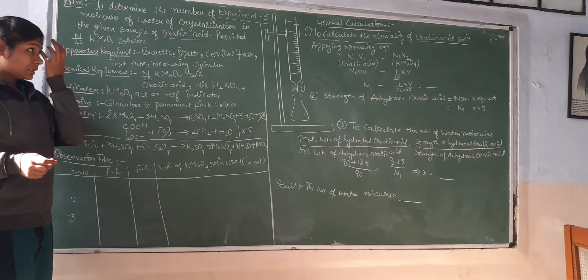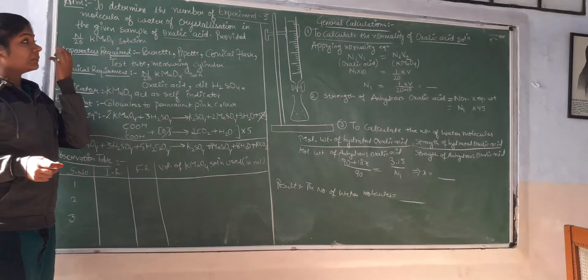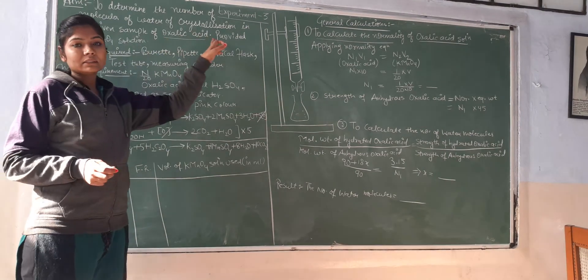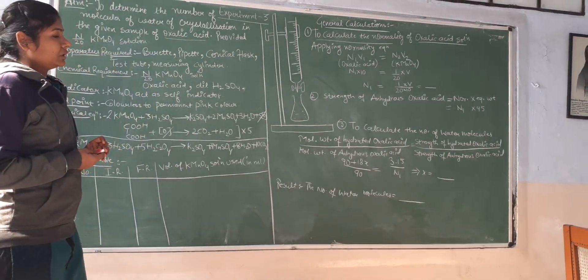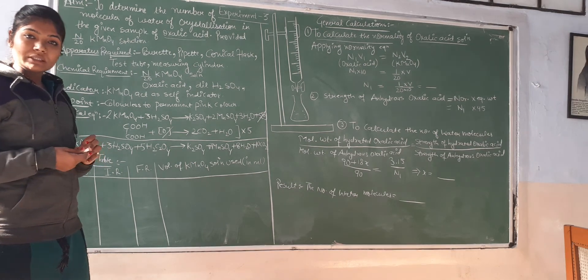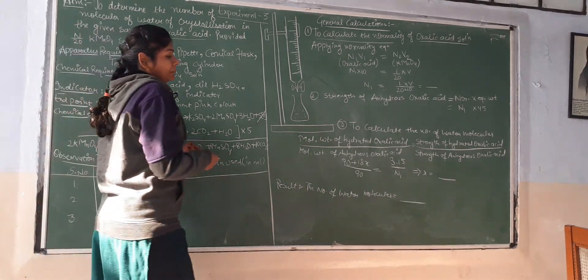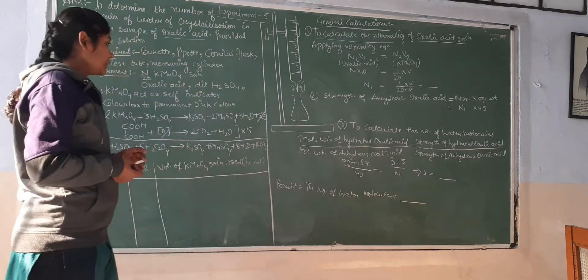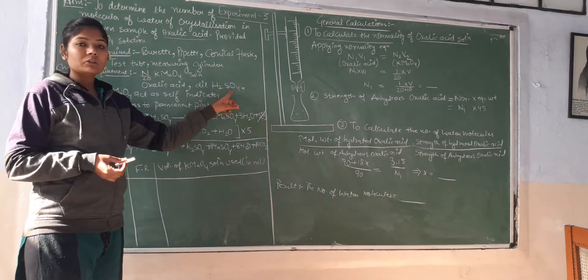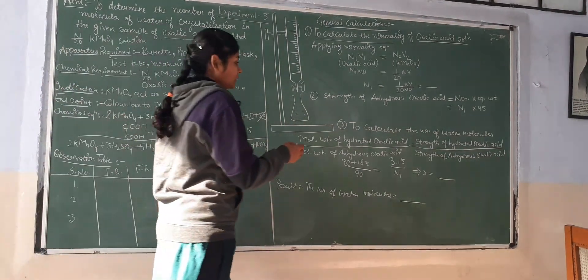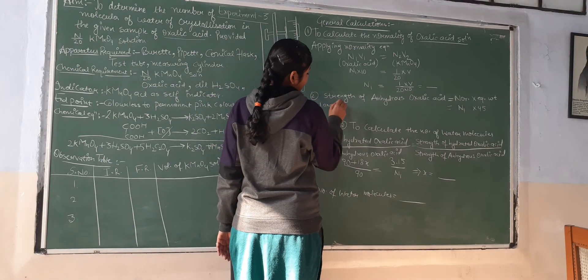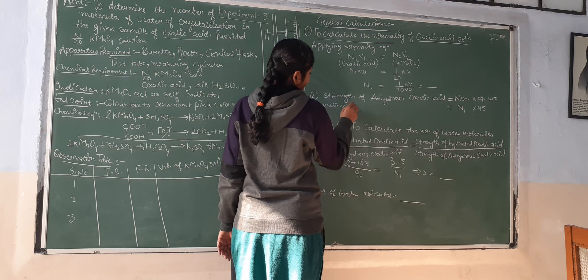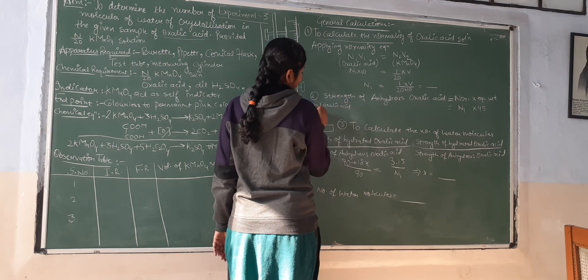Now we will do the practical performance. First of all, to calculate the number of water molecules in oxalic acid, we will take oxalic acid and then add dilute sulfuric acid to the test tube.